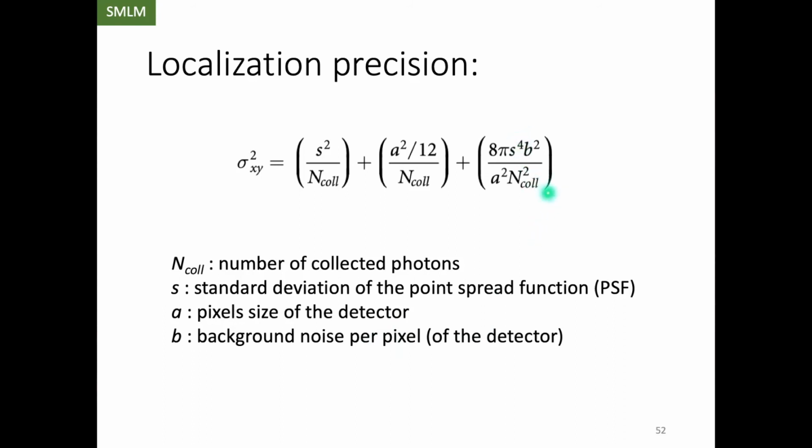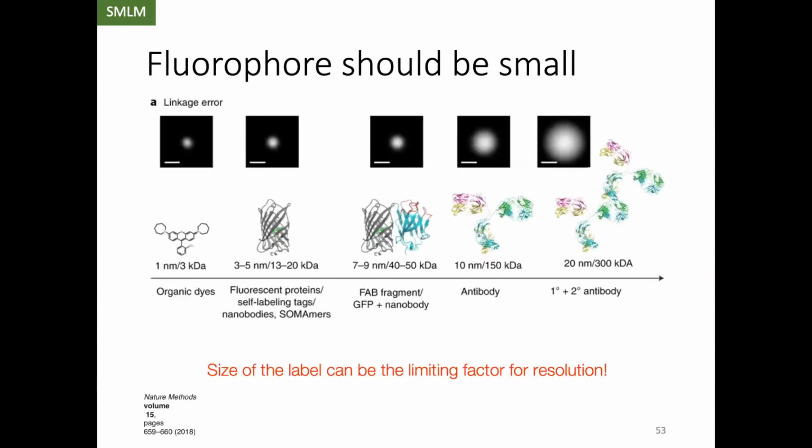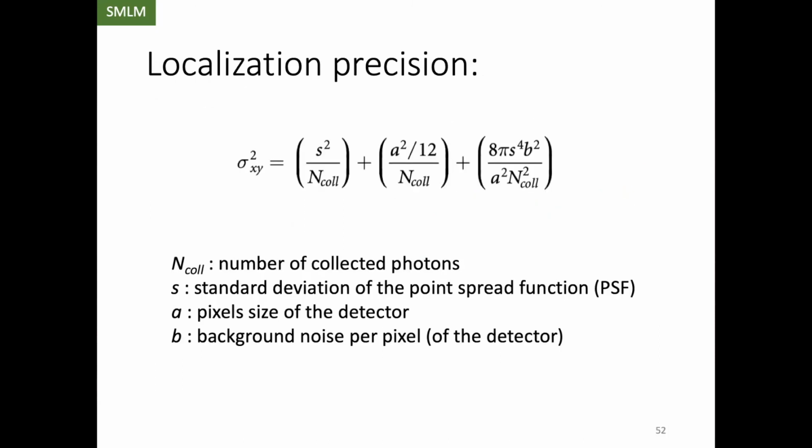A lot of detectors, their cost goes up because of the dark count, as it's called. If you don't have light on your detector, the detector sometimes still will give a small signal. So you want to have a detector which has a low dark count, as it's called. But they exist, right? So that depends on your detector, on your light source.